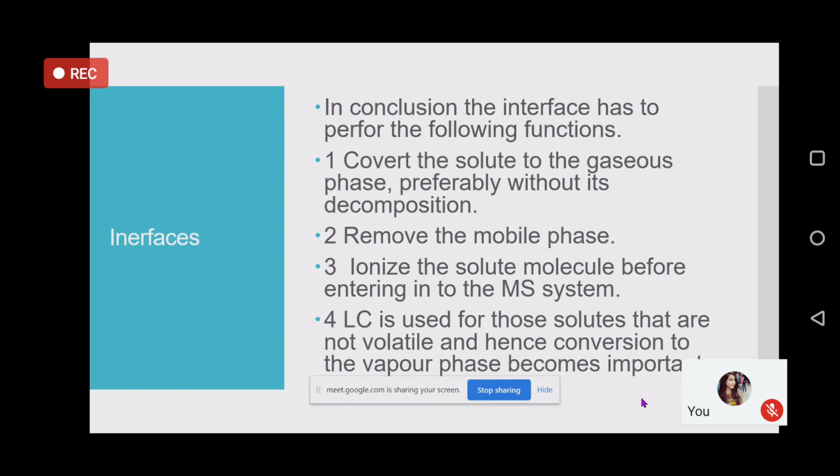If you are not going for LC-MS, then the LC technique is very versatile, very accurate, very sensitive, and all those things. It can be applied. But then why is LC-MS needed in that case? Is my question. Can anybody answer? Why do you need LC-MS? Because LC itself is sufficient. LC is an efficient technique. It can do qualitative analysis, it can do quantitative analysis, it can go to very low concentration levels and all those things. Then why should one go for LC-MS?